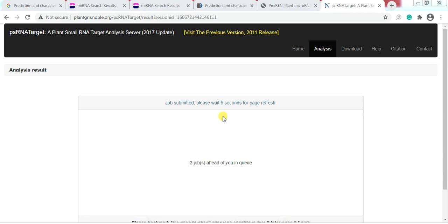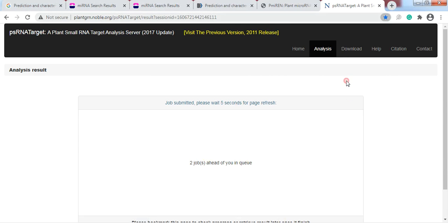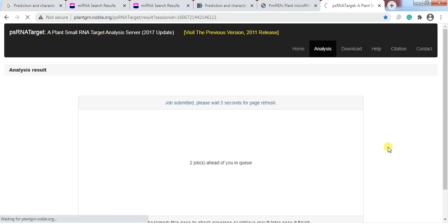When this process is ongoing, it is better to bookmark the page and come back after some time. When you return, the analysis will be done.